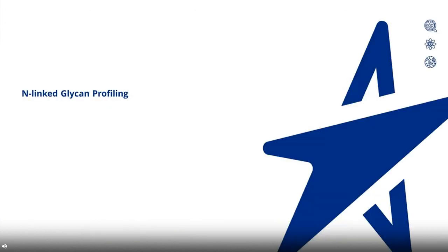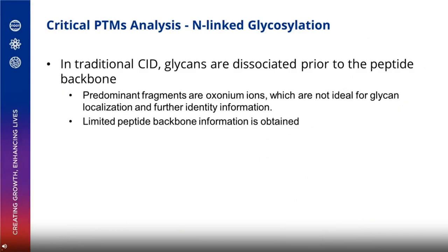So let's come to the N-linked glycan profile. Consistent glycosylation is critical for efficacy and safety of therapeutic glycoproteins. N-glycans are known to be a CQA in biotherapeutic characterization, as glycans possess many additional structural features, such as variable sequence, linkage, branching, etc.